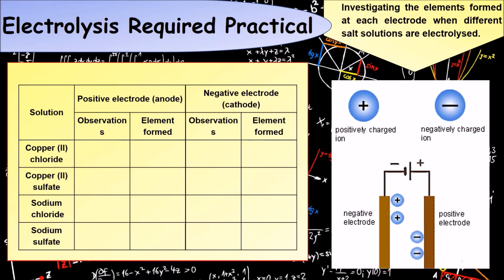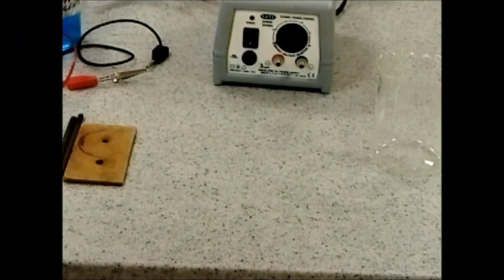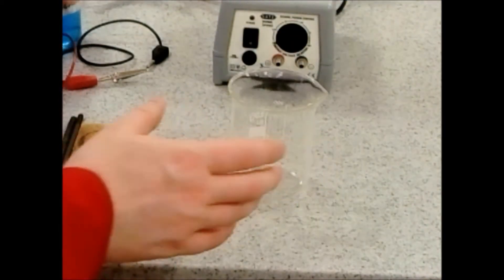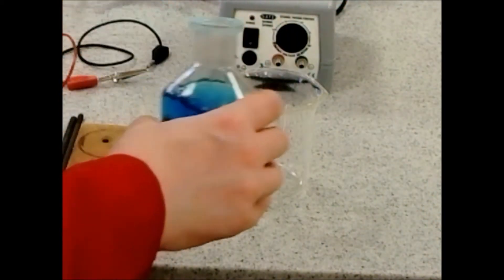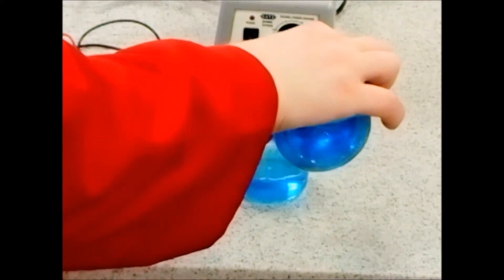The following short videos will show you how to set up the required practical and take you through the electrolysis of these four different substances. If you want to get the table down so you can physically write in what you observe at the positive and negative electrode for each substance, feel free. To start off, set up your electrolysis beaker, pour in your electrolyte — but don't pour in too much.